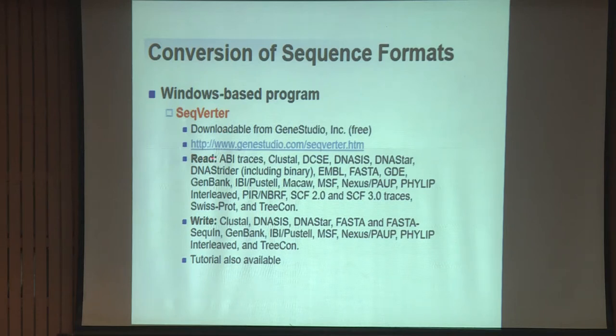So this software can read these different file formats and also write, that means convert it into other file formats. Tutorials are available on YouTube, you can see how to convert all of those. So it is not a very difficult task nowadays to convert into different formats, because different software uses different file formats. And today we can show you only one or two software.